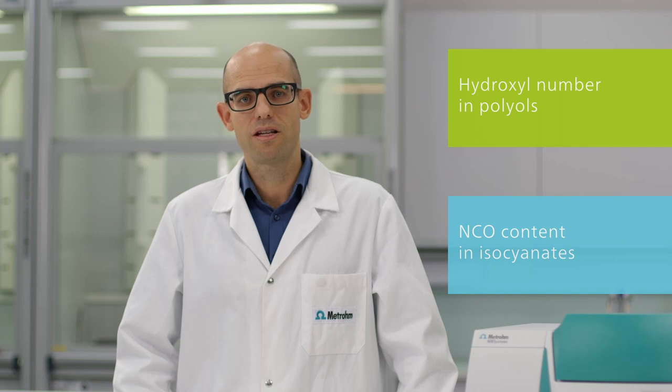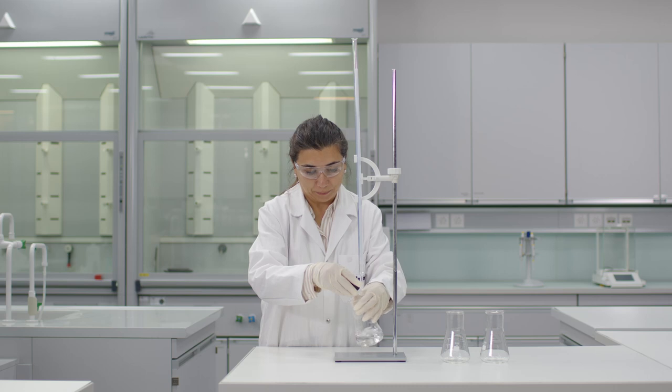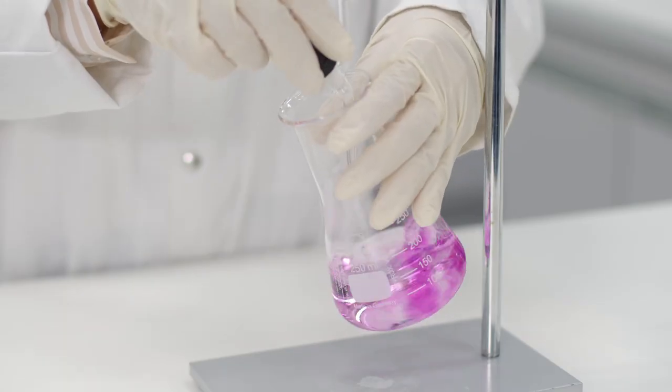The hydroxyl number in polyols and the NCO content in isocyanates are key quality parameters during the production of polyurethane, and are often measured by time-consuming wet chemical methods. Luckily, determination of these parameters can be done in less than a minute with NIR spectroscopy.